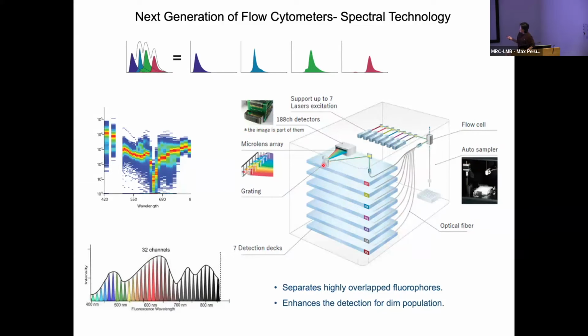Basically, they distribute the incoming emission light and diffract the whole spectral wavelength onto the detector, which means the whole emission spectrum is collected. So the software can further deconvolute the combined light by an algorithm. Here we use the weighted least square method.